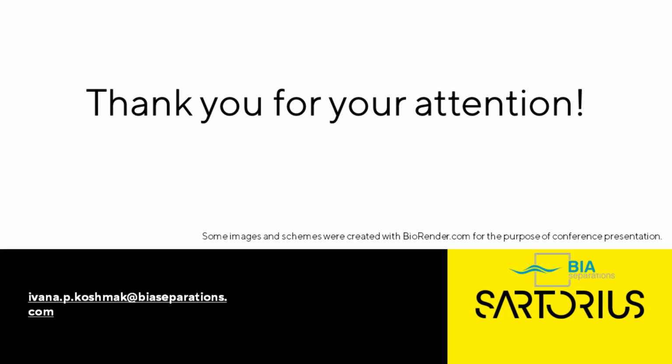What other analytics do you use for the upstream process development? So as I mentioned in this talk, it is very important to have more than just one method. So ideal is to have several orthogonal methods and also complementary ones. So we commonly rely, when it comes to AAV upstream, on ddPCR. We do valve switch for empty full. We also do size exclusion analytics. We measure DNA content with a PicoGreen staining, usually combined with different chromatographic methods. We make a total AAV quantification using the CIMac SO3, which is cation exchange analytics, and we also have different plate tests available for total DNA and total protein.